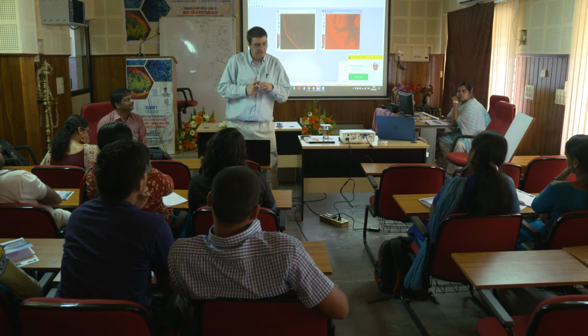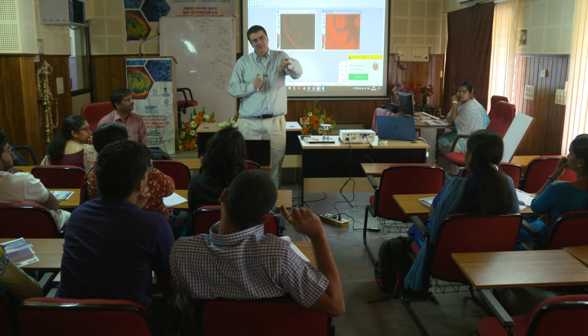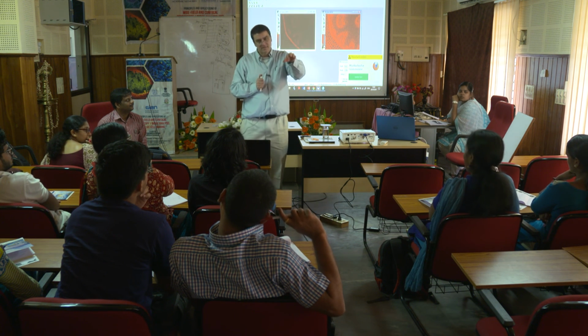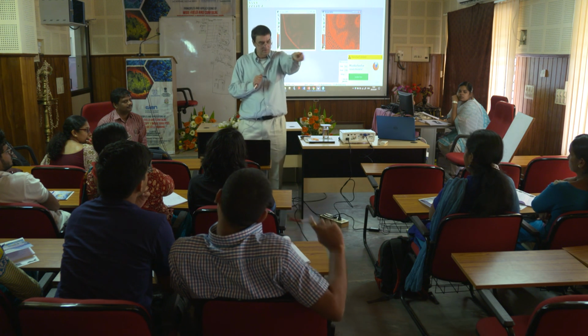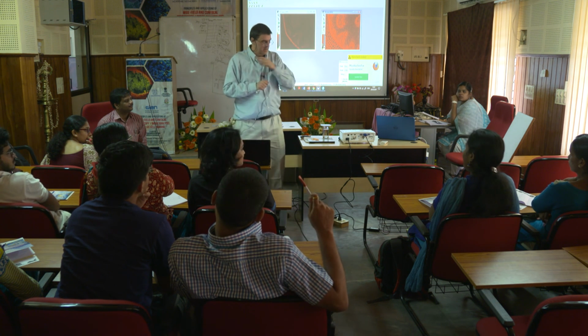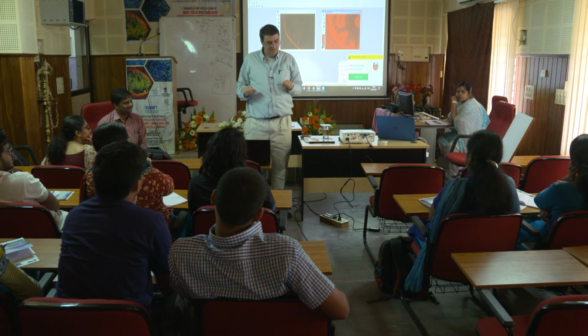It is, that's part of it, but more than one fluorescent dye, I don't know if I explained it correctly actually. That are where? Overlapping, right, they're in the same location, okay?